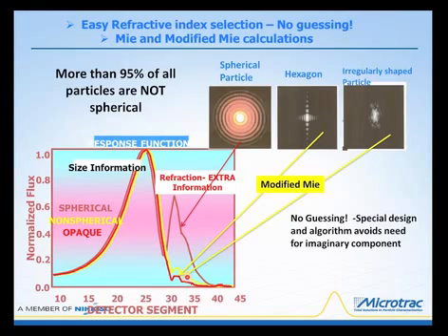This provides the best starting point for the calculations going from our fingerprint of the signal pattern to the particle size. Now, in Microtrac instruments, materials that are considered opaque, and we're showing this down here, opaque particles, meaning black or dark blue or something like that, they tend to absorb an awful lot of light. This is the pattern here.